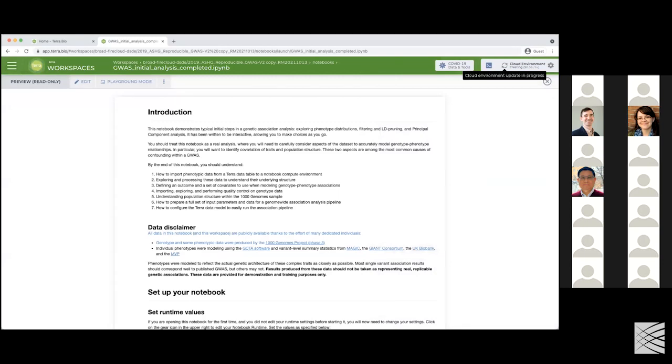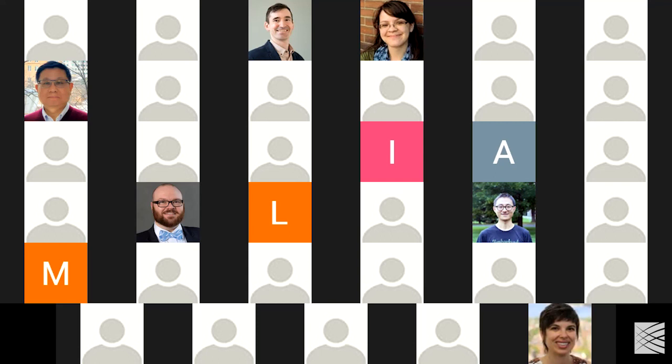And you'll see that the status of the widget has changed. It now says creating at the cost of 6 cents an hour. And there's this circular arrow icon to indicate that it's starting up. Okay, so I'm going to stop sharing my browser. We'll come back to it. Again, it's going to take about 3 minutes, so we can take a look at a few slides while we do that.